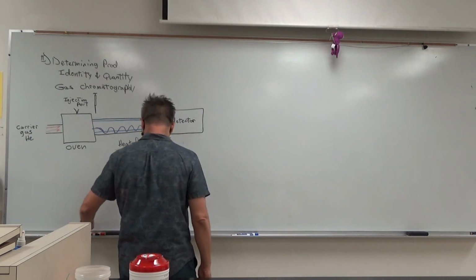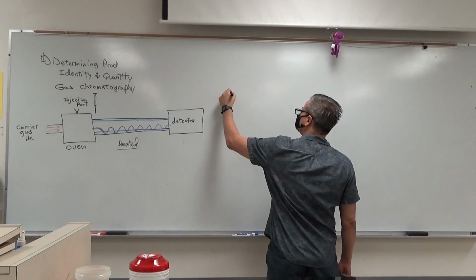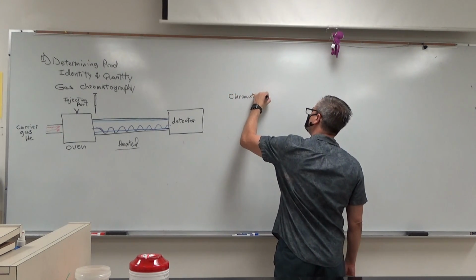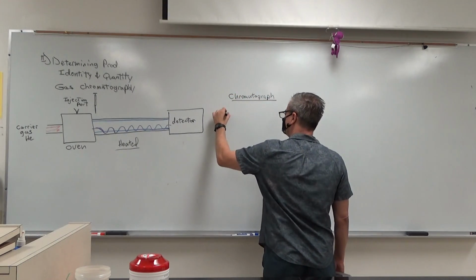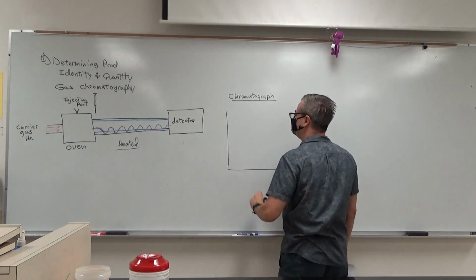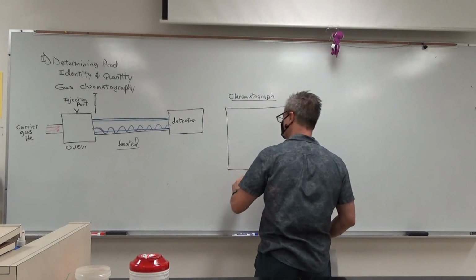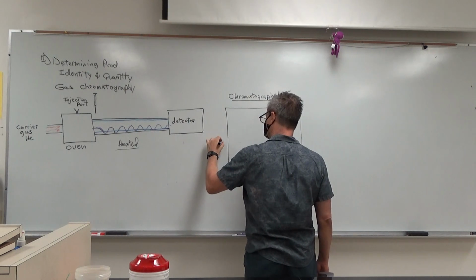All right. Now, what you can do is you're going to get a chromatograph. Here is intensity.